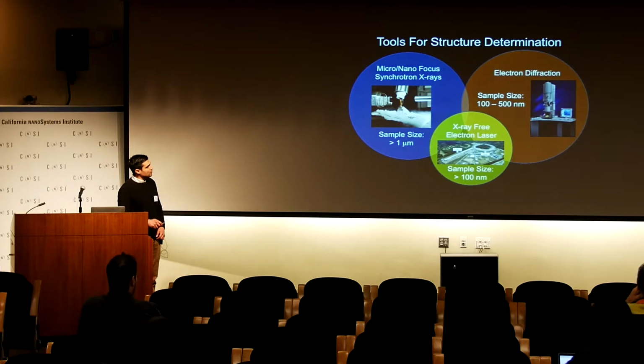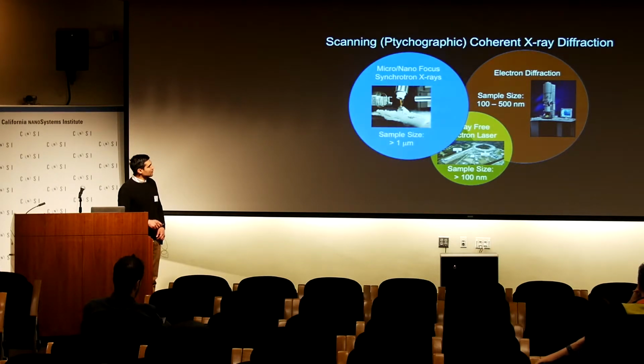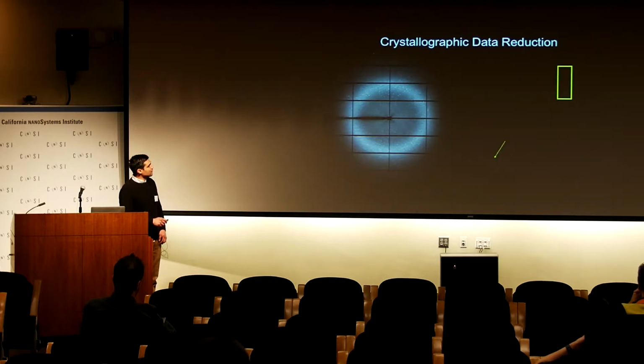The third type of experiment that I'll tell you about today is a bit different. It's a tabletop experiment compared to the first two. And this uses an electron microscope to do the experiment instead of these. The biggest difference is that you can have one of these in your bedroom if you'd like, whereas you can't with these. And so I'll tell you first about experiments to do with cellular ultrastructure using synchrotron X-rays.